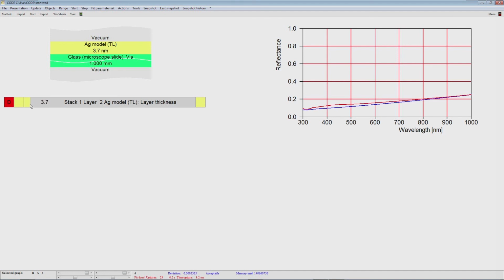Okay, we can do that. We have to do that anyway. So we can do that now. So let's improve the fit. Let's first continue to visualize some of the results in a more useful way, and then we will improve the fit and watch if we could make some progress. It would be good to see all the thickness values in a graph, and there's a view object that can do that.